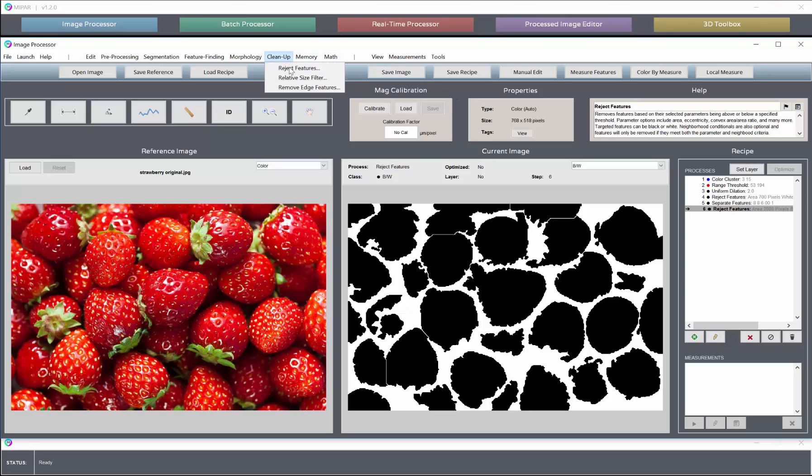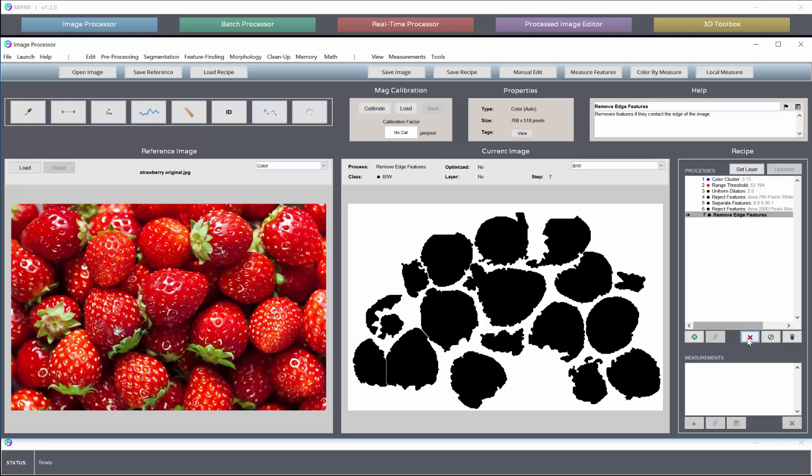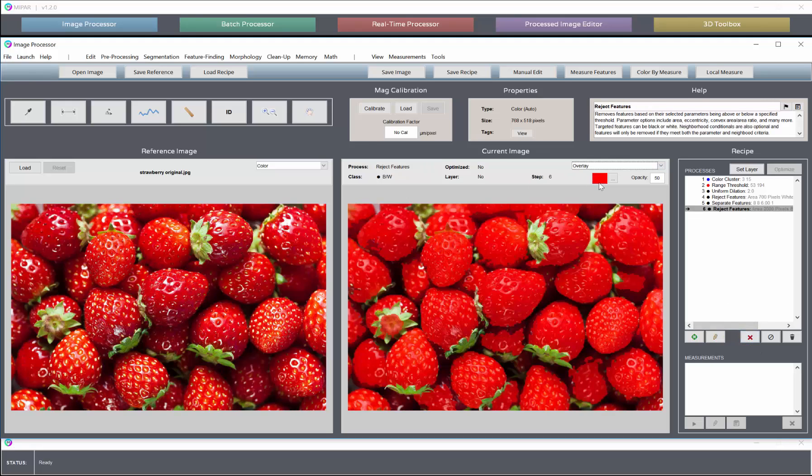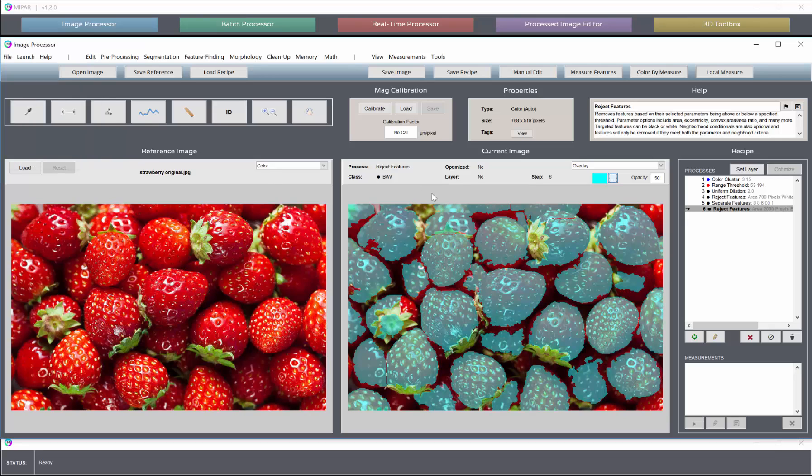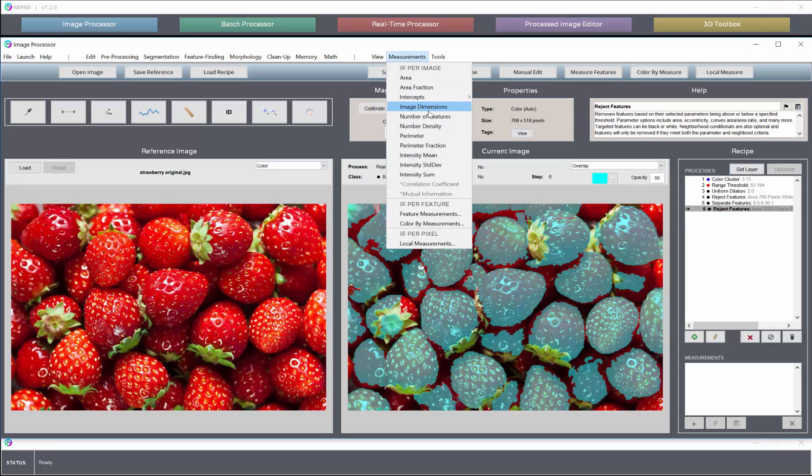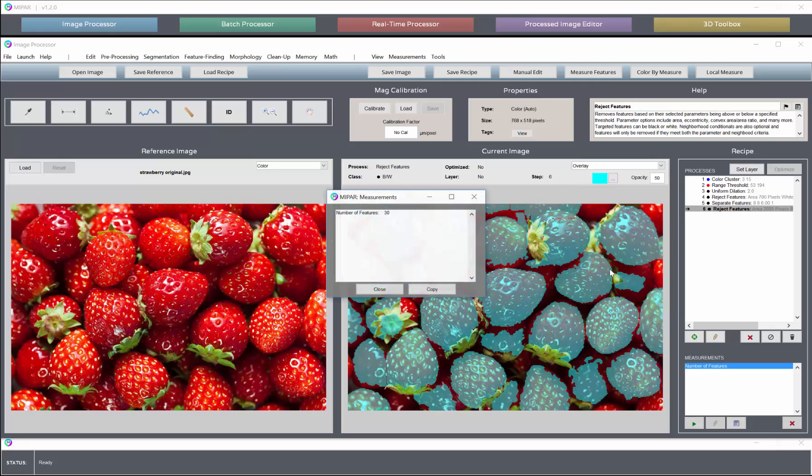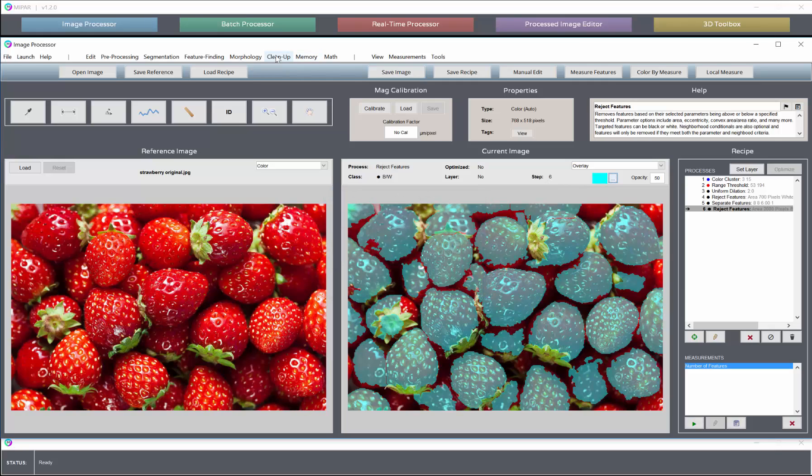If we wanted to, we could remove edge features here or keep them in place. And now we can see if we switch our overlay color. We've put a marker on just about every strawberry except for the ones on the very edge. Thirty berries counted without the edge features.